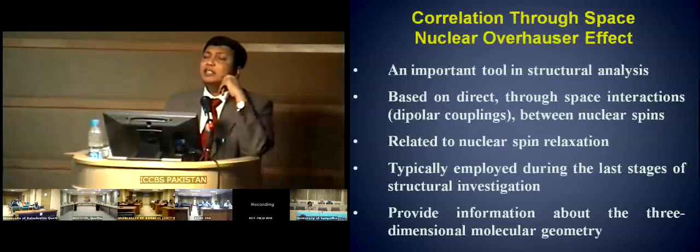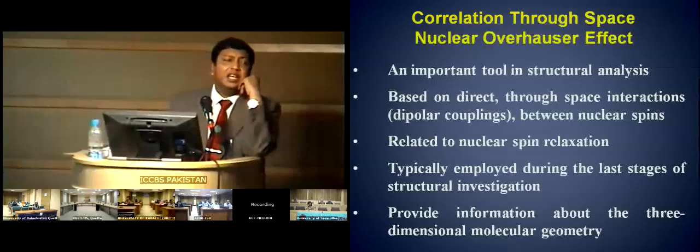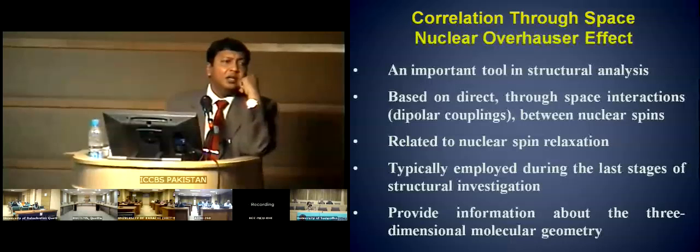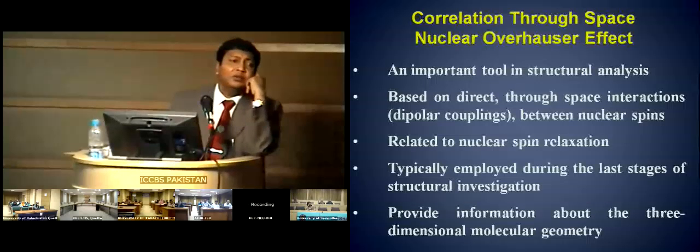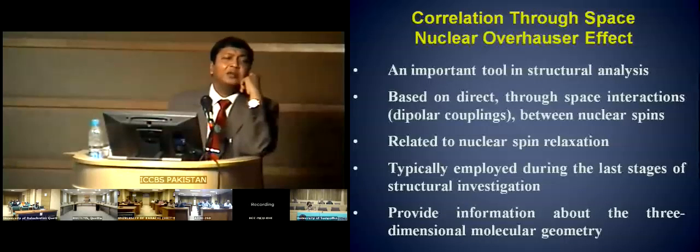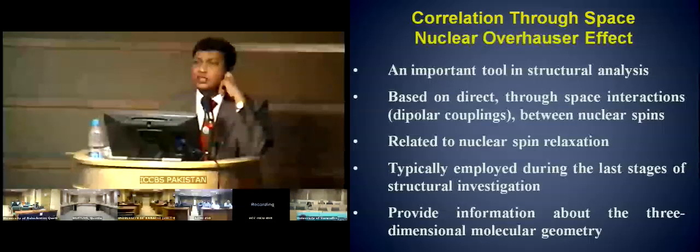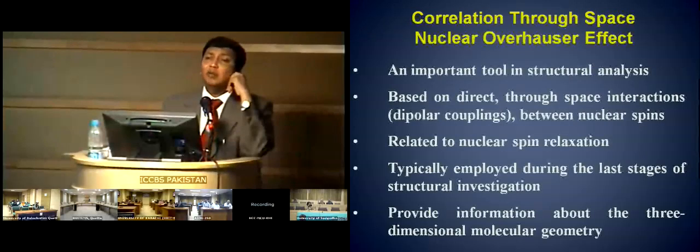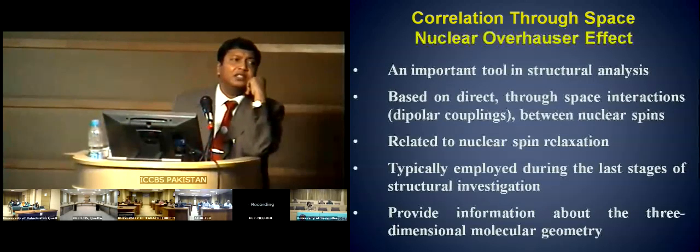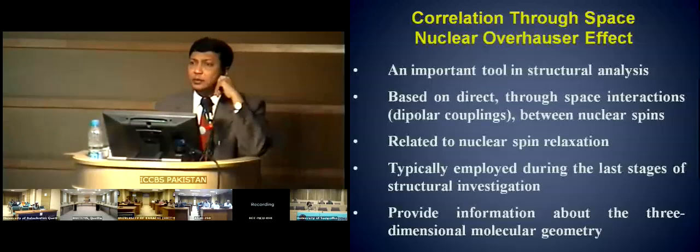Then we learned that the problem of sensitivity can be solved either by improving the hardware or by using appropriate data processing, multiplying with certain factors. We also learned that there is a novel technique through which you can increase the intensity of a signal, which is polarization transfer.